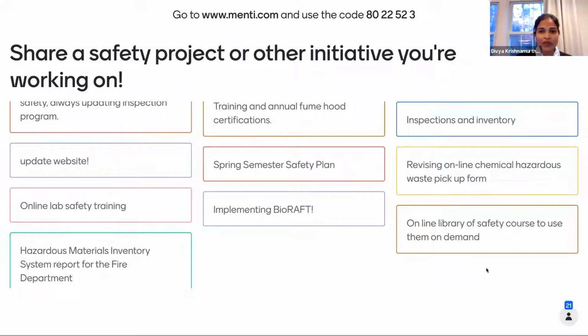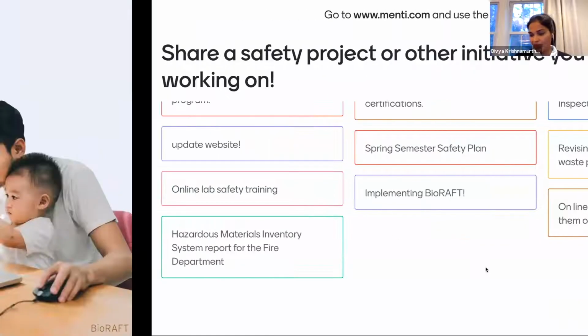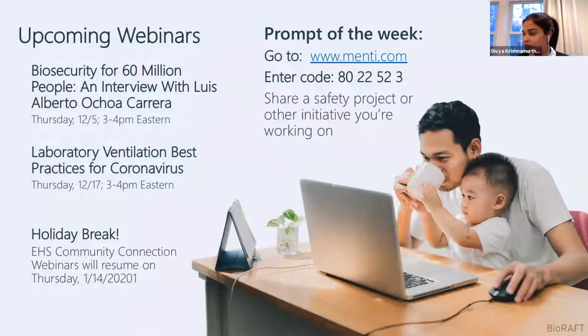We use our chemical inventory, but we have what I'm going to call a chemical management system that also has an SDS module. Essentially, anytime we have an incoming chemical, part of the barcoding steps includes searching the database and uploading the safety data sheet. But prior to deploying this barcoding system, we had a historical archive of several safety data sheets. So what we did was a data share upload of that first, to ensure that the safety data sheets were uploaded.